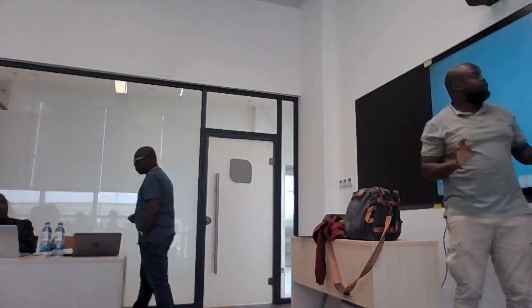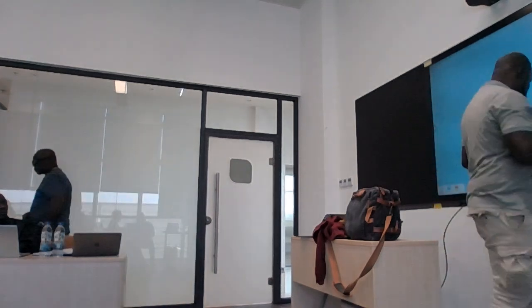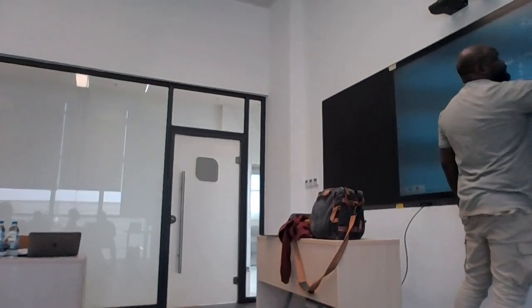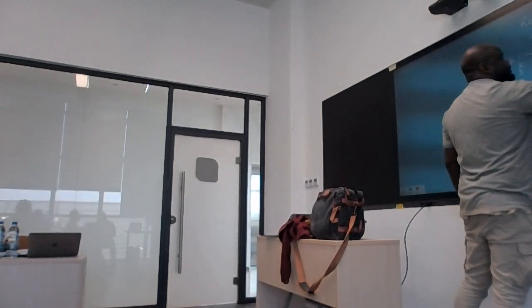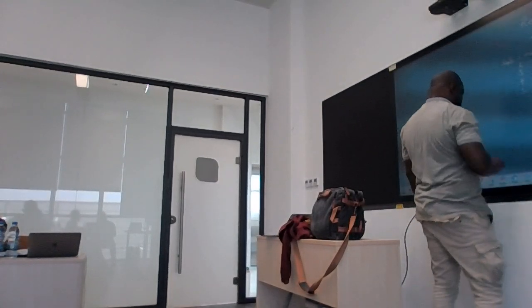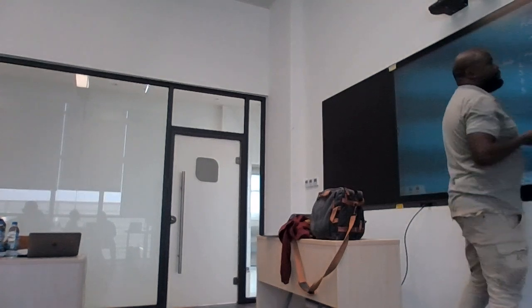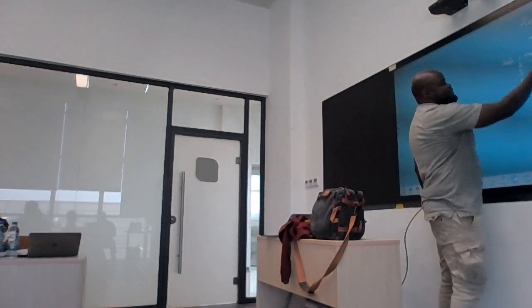So here we've not done any trimming. So if we set our quality here to, say, greater than or equal to 30, this sample will not go through, right? This one as well, right?